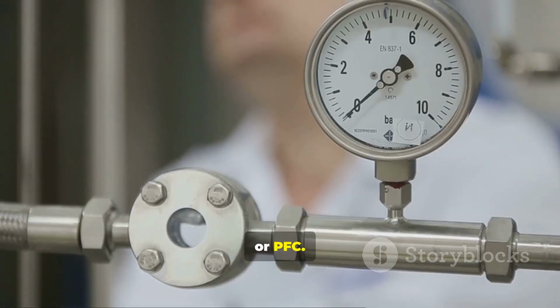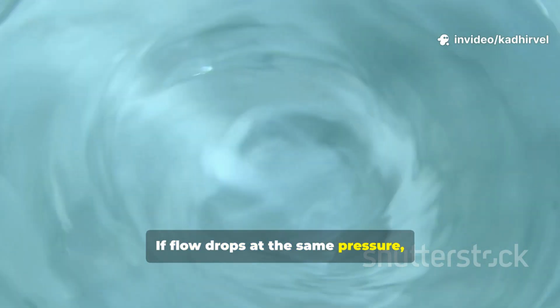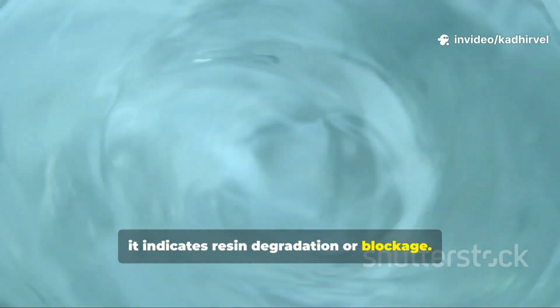Pressure flow curve, or PFC. PFC evaluates the mechanical stiffness of the packed bed. If flow drops at the same pressure, it indicates resin degradation or blockage.